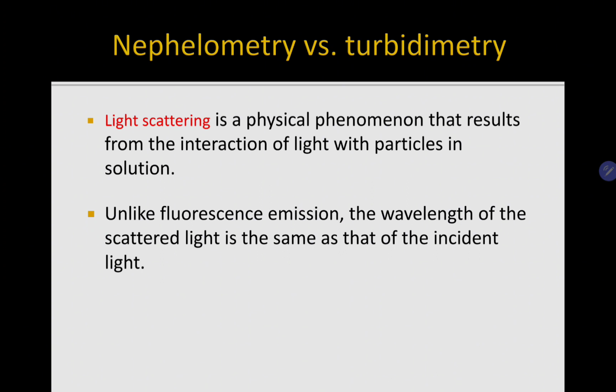light. So ang nephelometry guys, no, parang kung sa fluorescence po, yung inyong incident light, yung binigay na ilaw is greater than yung sa kanyang gina-emit na ilaw, kasi di ba gi-absorb niya yung ilaw, then mag-emit siya ng energy in the form of photon, no? Then mas mataas yung na-absorb niya compare sa kanyang gina-emit. However, when we say nephelometry guys, no, same lang sila. The wavelength of scattered light is the same as of incident light.